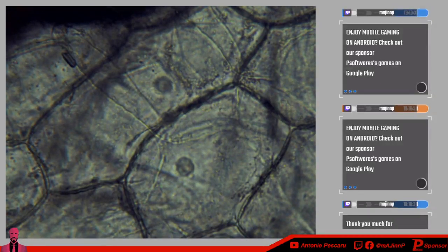With that being said, as you saw in the slides presentation, I was speaking about the cell wall, and I said I was going to come back to it. Now, the cell wall compared to the cell membrane, as I've said, the cell wall has multiple functions that we're going to get into, but one of the primary functions is to ensure that the cell takes its adequate amount of space that it can take. As you can see, this is the space that it can take, right?